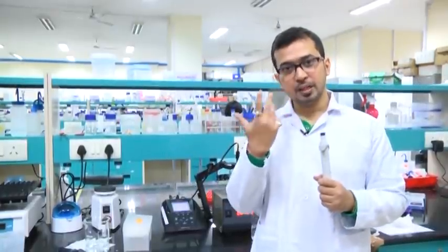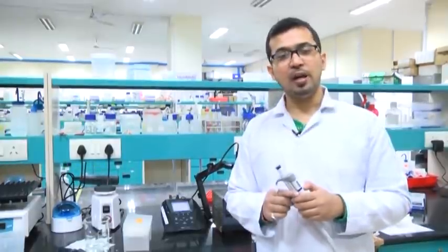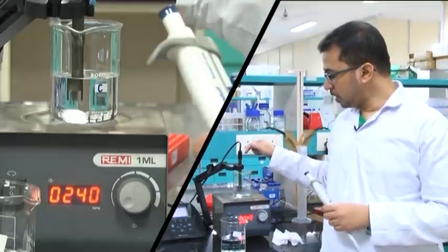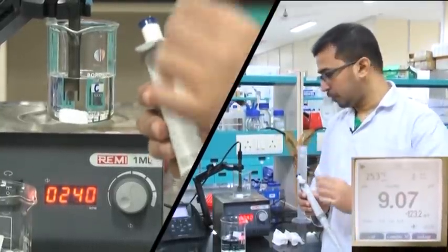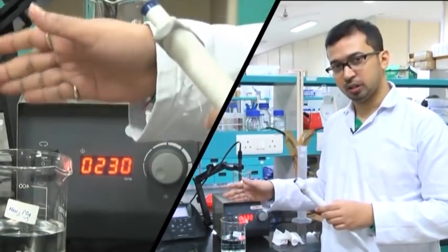The solution we are preparing is pH 7.4. For pH 7.4, we take the dibasic solution (pH ~9) in the beaker and add the monobasic one (pH ~4) to bring the net pH to around 7.4. Here you can see we have taken the dibasic part in a beaker with the pH electrode immersed — the pH is around 9.07. The monobasic one has a pH around 4, measured just a few minutes ago.